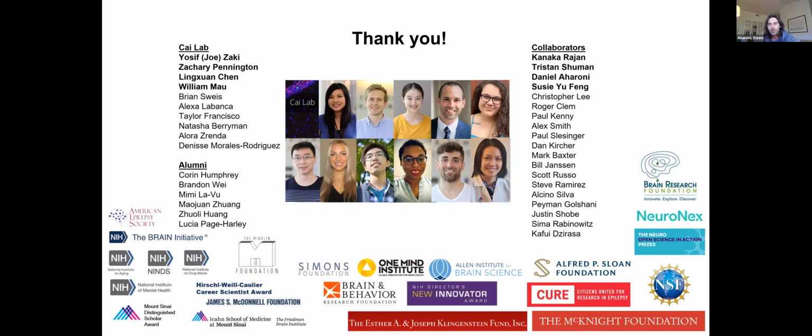What is the max length recording video that Minian can currently handle? Oh, I would love help from the audience. As you can imagine, I don't really personally run a lot of experiments, so all the information I hear is from my lab mates. I heard maximum 2 hours maybe, but if anyone here has a say on that, longer than that. Theoretically, it should go longer. Theoretically, it could go arbitrarily long.